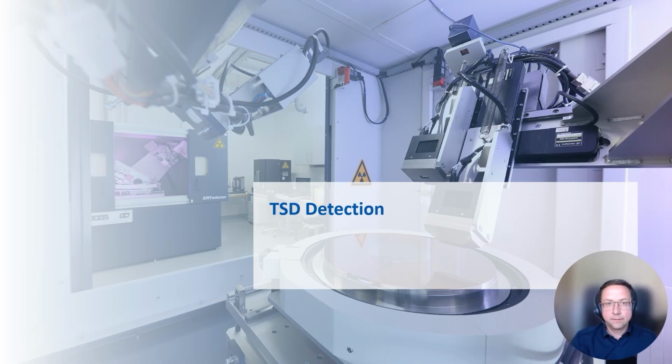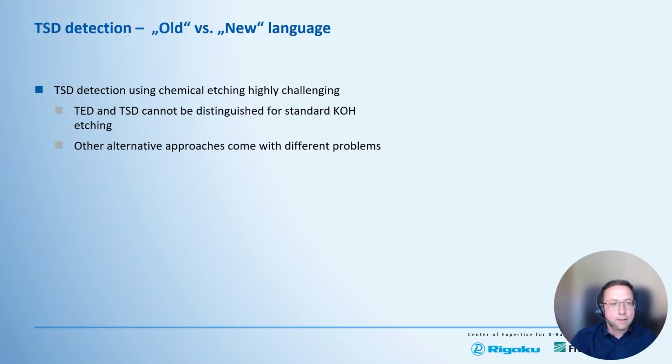Let's start with the TSDs. If we're talking about TSDs as well as BPDs, we have to start also with an old language which is used for defect recognition and defect counting. So typically in the older times, these kind of defects were visualized using etching, so chemical etching methods.